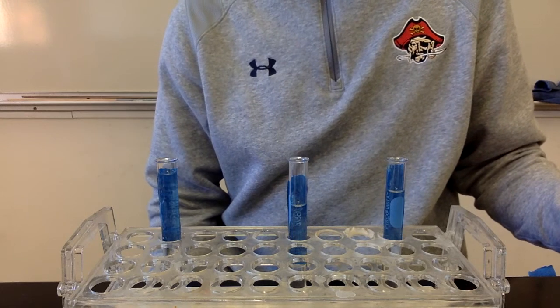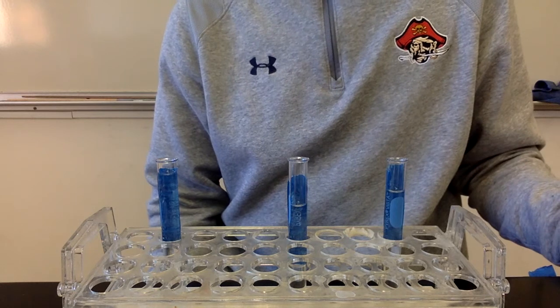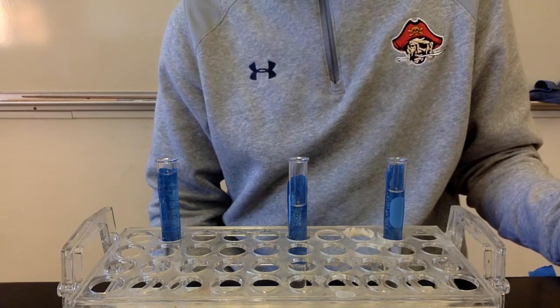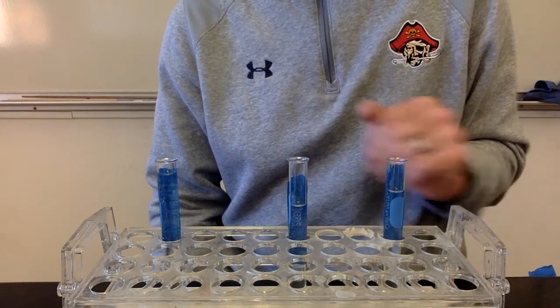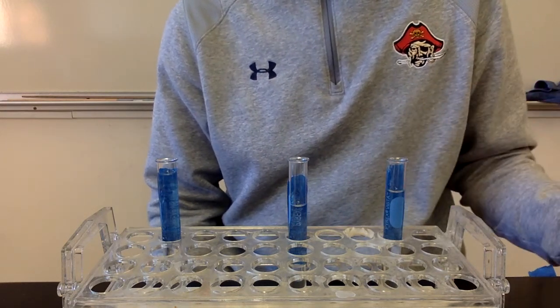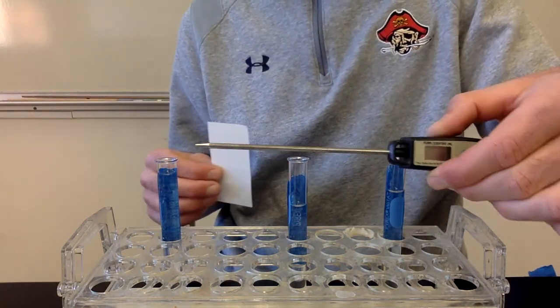And what we're going to be doing is letting them evaporate, letting them turn from a liquid to a gas. And we're going to see how the temperature changes as they turn from a liquid to a gas. And we'll be looking at which one evaporates the fastest and which one absorbs the most energy as it is turning to a vapor.